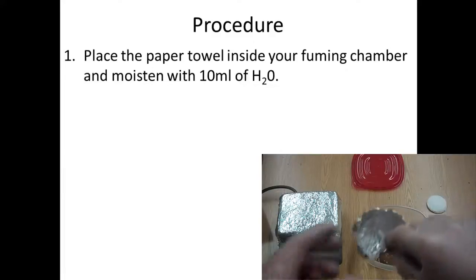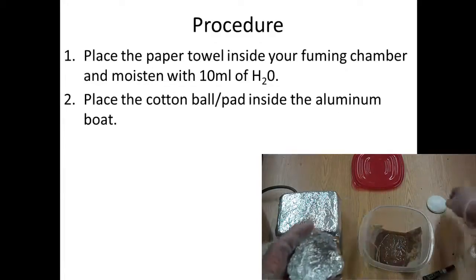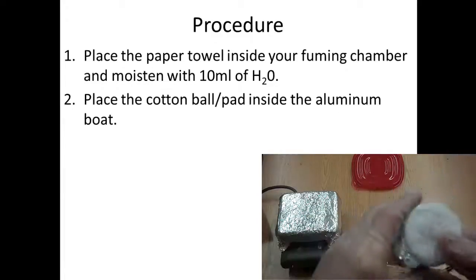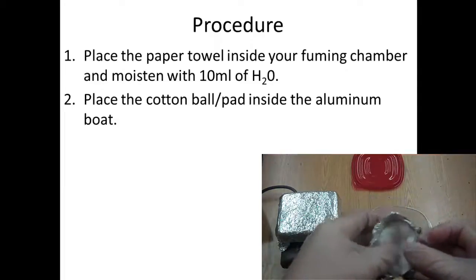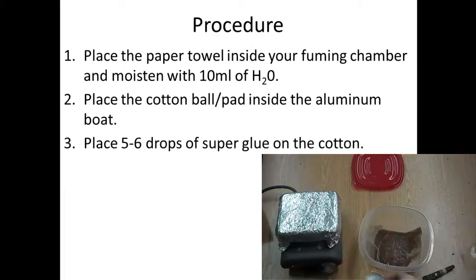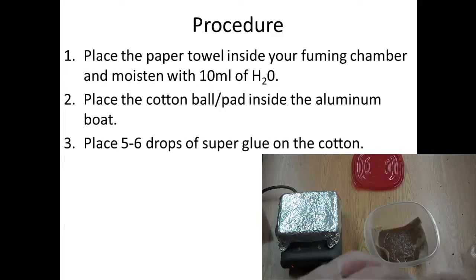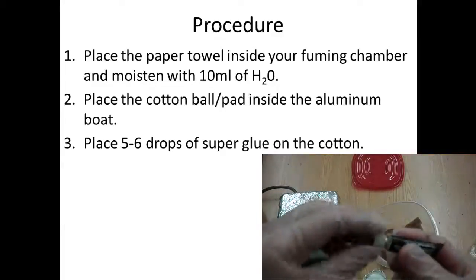Take the cotton ball or the cotton pad and place it inside the aluminum boat. And to that, place about five to six drops of the superglue on the cotton, being very careful not to get any superglue on your fingers because it will cause them to stick together.